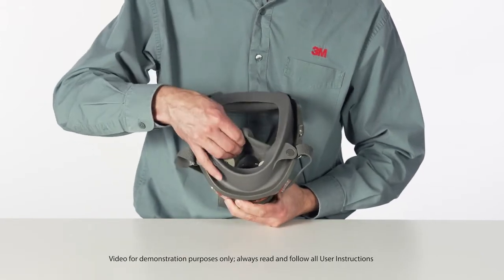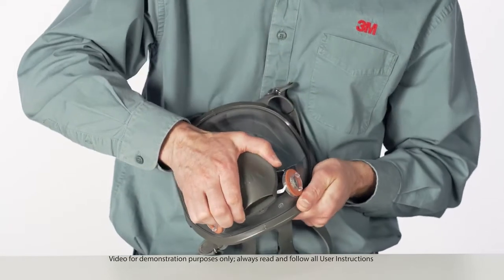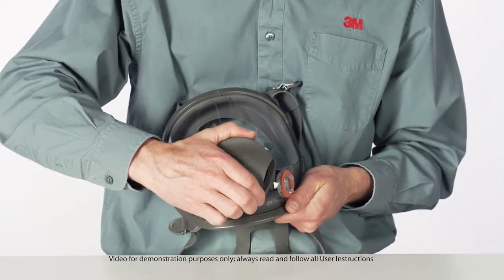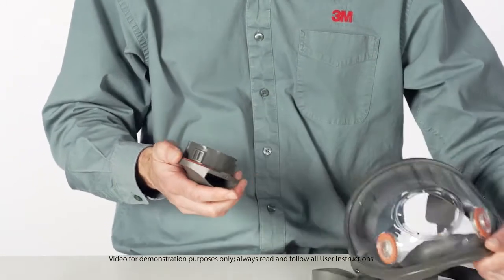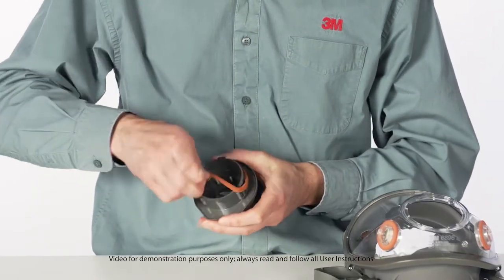Remove the nose cup assembly by pulling it away from the center adapter. Grasp the center adapter cover and twist it counterclockwise one-quarter turn to disengage it. Remove the center adapter from the lens, then remove the center adapter gasket.